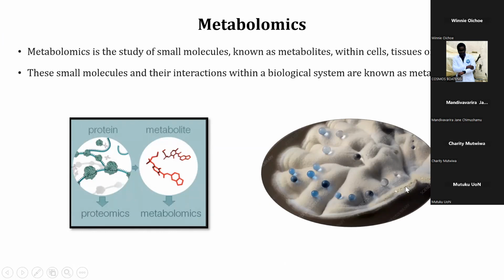So here this is a colony of actinomycetes, and you see these droplets. These are the droplets that are produced by this particular actinomycetes. You can start seeing these droplets after around 5 to 6 days. And these are the active compounds that act against any bacteria or fungus, meaning they are antimicrobial in nature.